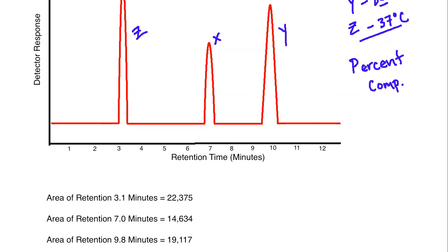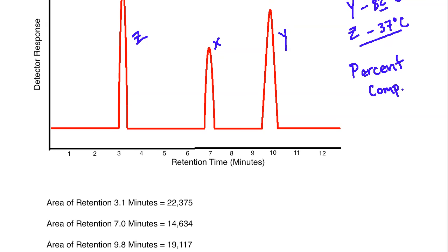Coming down here, if we take a look, we've got the area of retention for 3.1 minutes, the area of retention for 7.0 minutes, and the area of retention for 9.8 minutes. And they each have a value there. You can see the one that has the most area underneath the peak is going to be the one at 3.1 minutes, and that has approximately 22,375 there. The area for 7 is going to be the least, and then the area for the peak at 9.8 minutes is going to be right in between that.